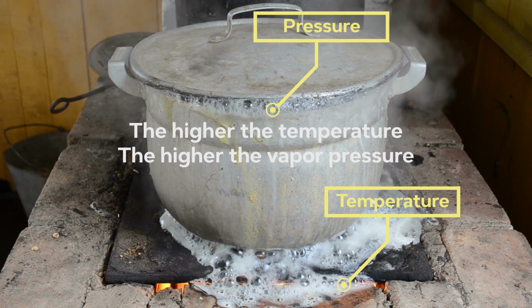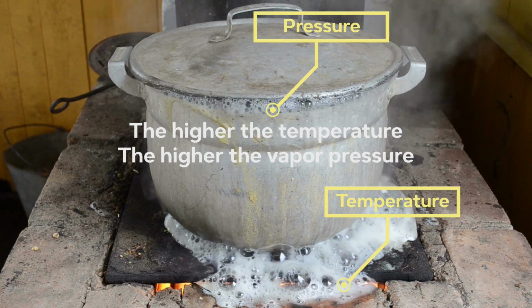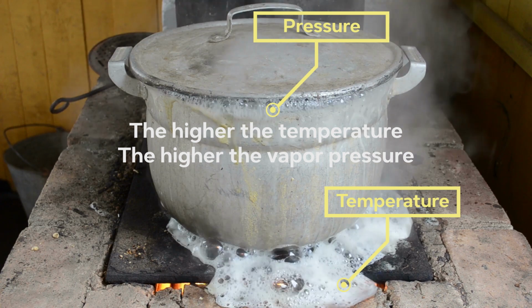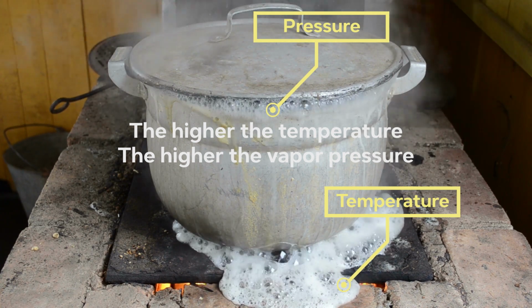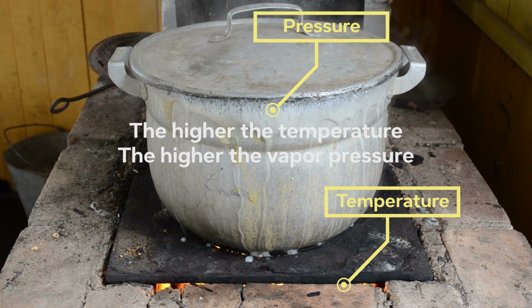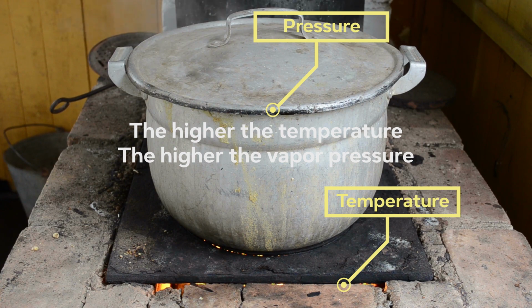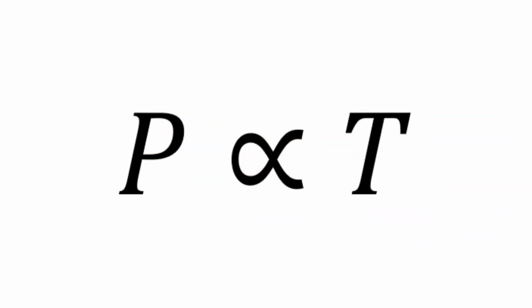And we can observe that different components react differently. That is, we can observe that different components boil at different temperatures. Or said another way, different components produce different vapor pressures at similar temperatures. And it is this difference that we can take advantage of. So let's put this new observation in the form of an equation. The vapor pressure of a component is directly proportional to the temperature of that component.